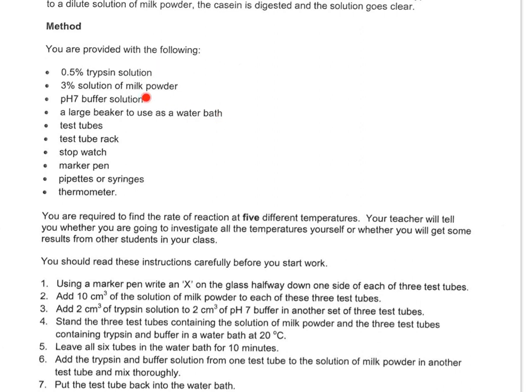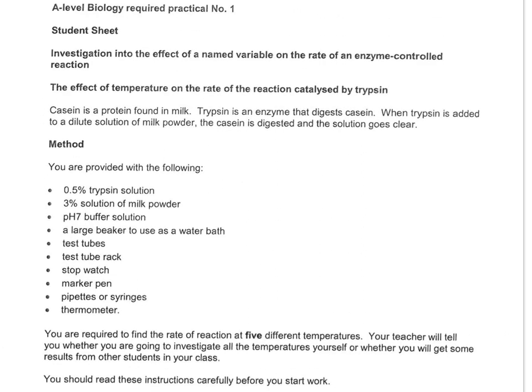Remember, it's important that you only want temperature to affect the rate of reaction. That is why you need to keep these three the same, because they would affect the rate of reaction. If they were not kept the same, the results would not be comparable.